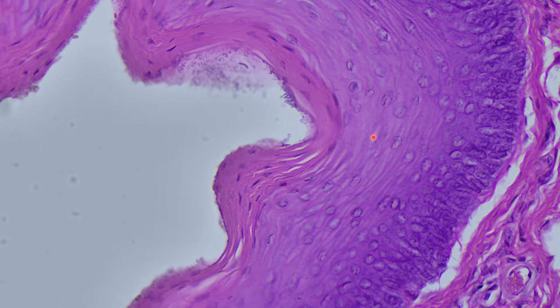Identify the tissue from here to here. So that green line is roughly where our basement membrane is. Here is our apical surface, or where our lumen is, the hole here. Since we have layers of cells lining an empty space, we know this is going to be an epithelium of some sort.